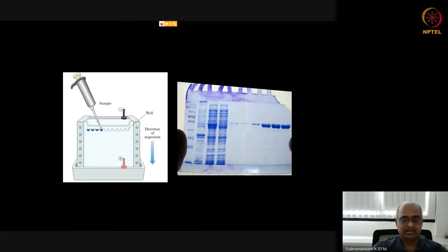So the acetate ion is going to be the medium for conducting electricity. You add the agarose into that, then you put it in the microwave and heat it, and then it melts and dissolves into the liquid. So it becomes a clear liquid. Essentially, the long polysaccharides are hydrated in this heating process with the buffer. The buffer is primarily water.